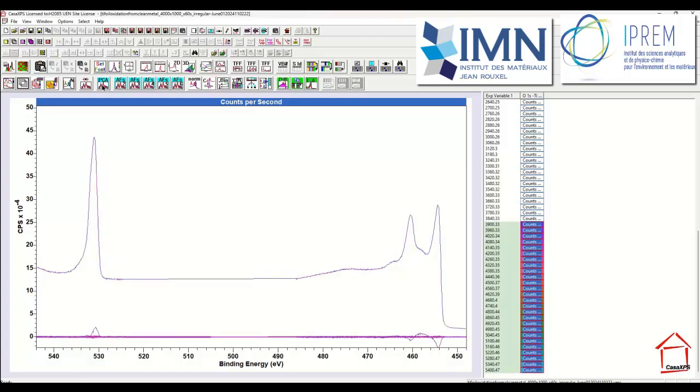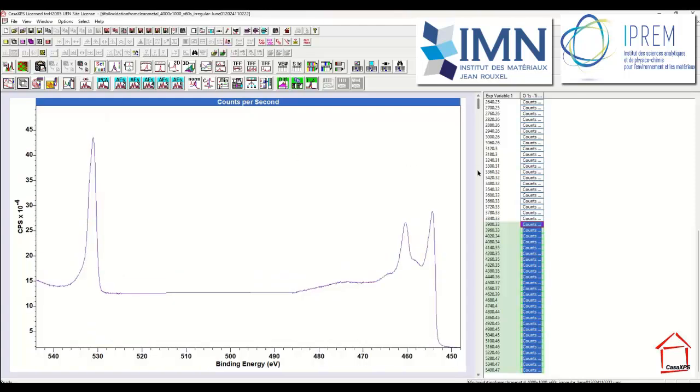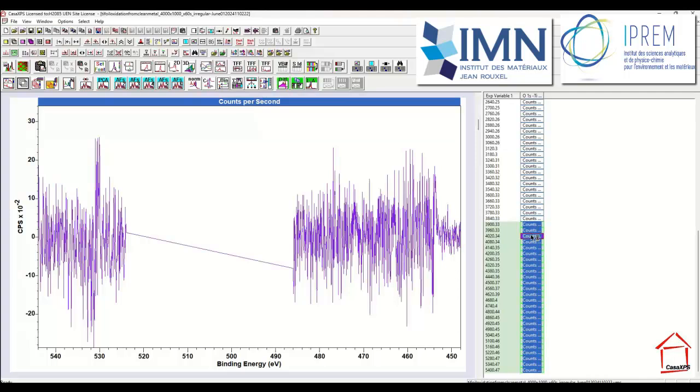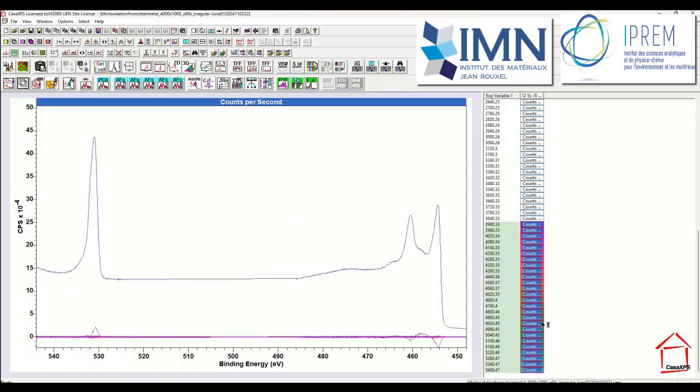So when I perform a PCA on these data and look at the abstract factors again, that third abstract factor now looks like noise. So that suggests that I can reproduce all of these data in this part of the experiment using 2 abstract factors.